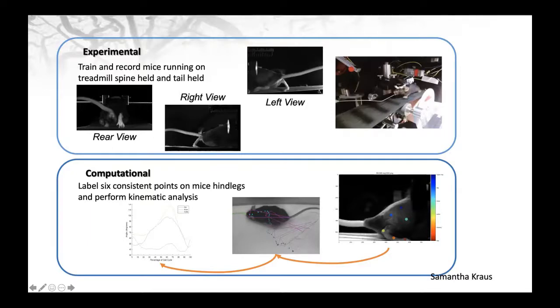We're then able to output the CSV data to create a wireframe diagram over a different number of frames, and then correlate that to what we see in the calcium traces.